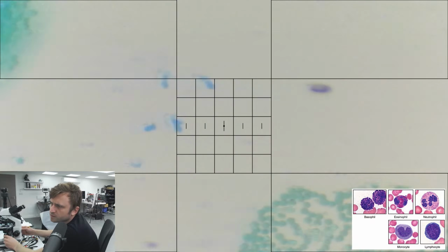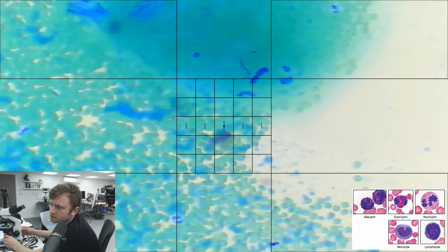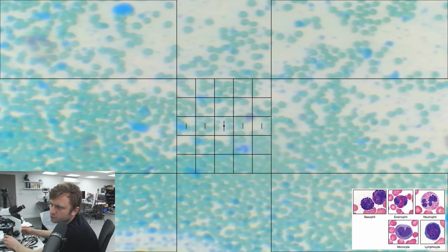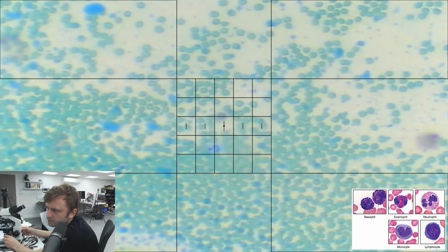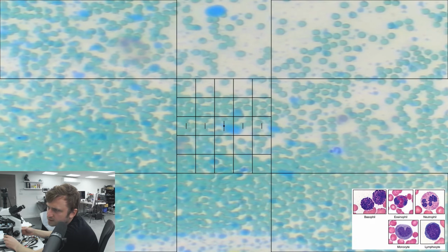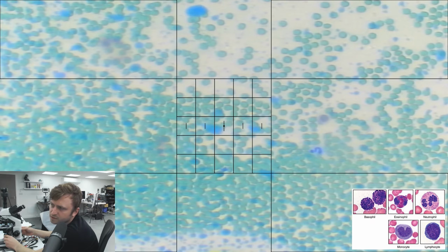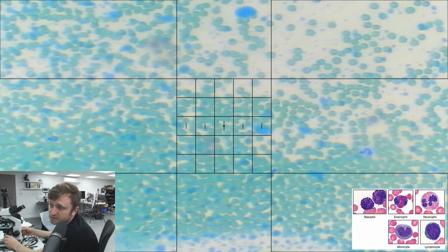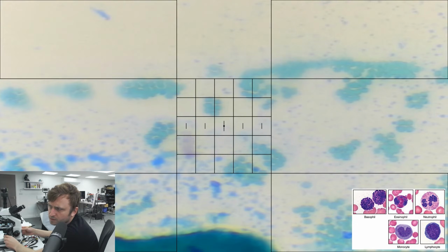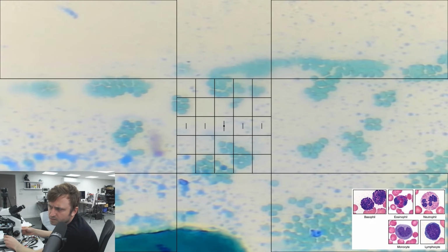No, debris, unknown, uncertain whether any of those actually are. Too thick on the clumping, neutrophil, and unsure. No, I think that's just dirt there, kind of leaving a shadow. Unsure about these blue marks in here. Again, maybe the case of extra staining required to identify potential basophils. Don't know. Again, shadow. I'm gonna go ahead and say lymphocyte.